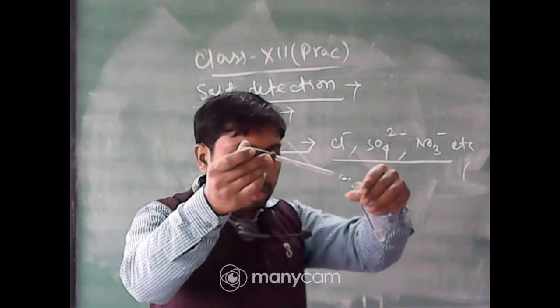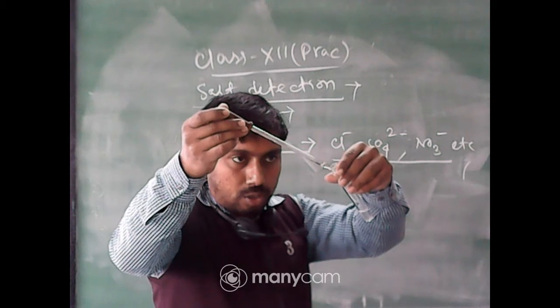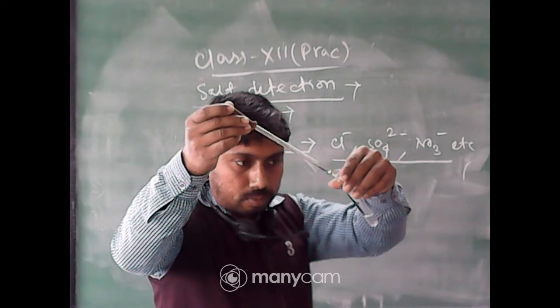Now you will look at the solution portion of the test tube.